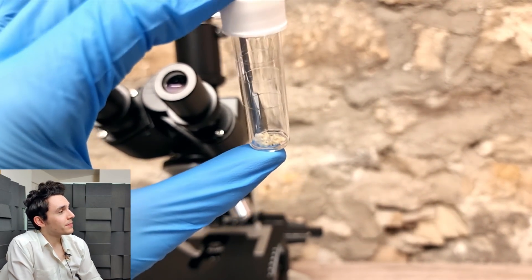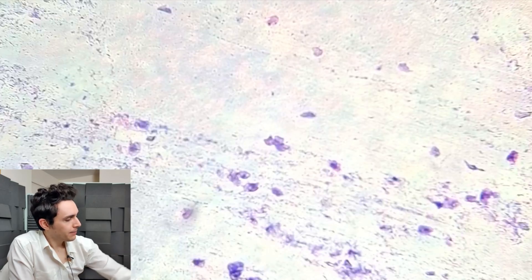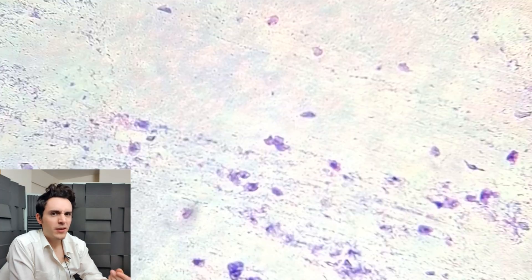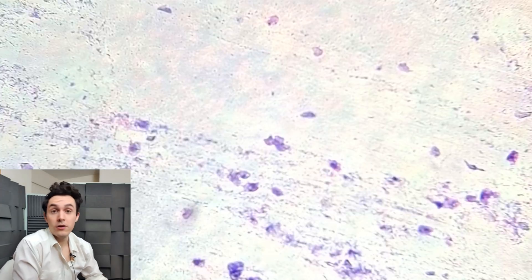These sort of white clumps have the consistency of cottage cheese. What I've done here is I've taken one of those clumps of dead skin, which are fairly moist and squishy, and basically smeared it across a microscope slide.